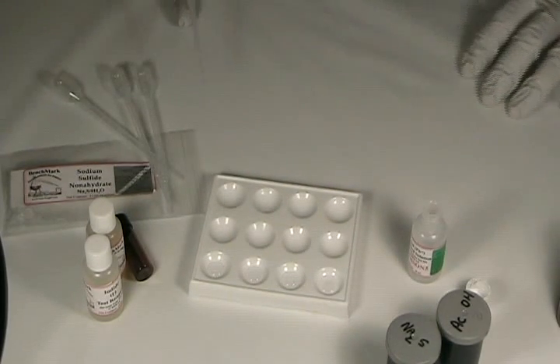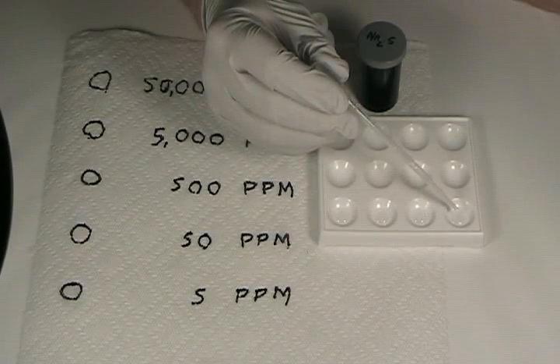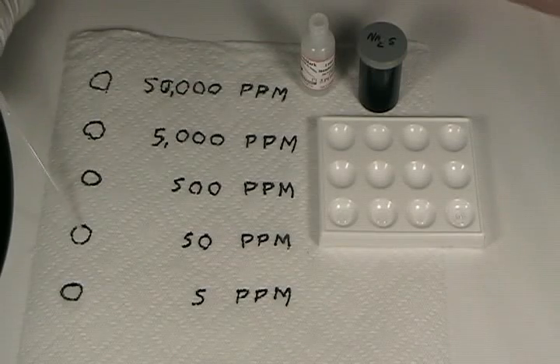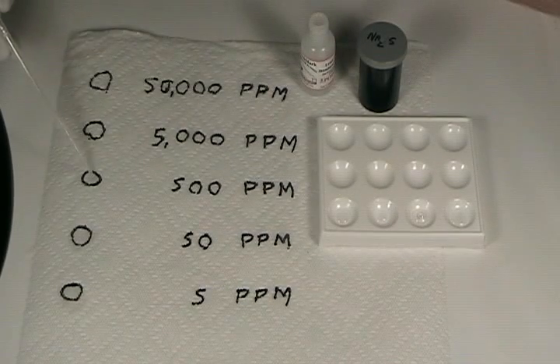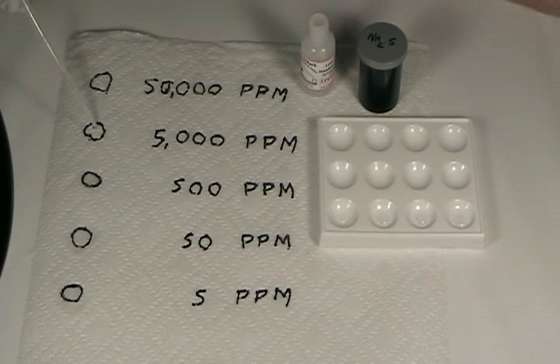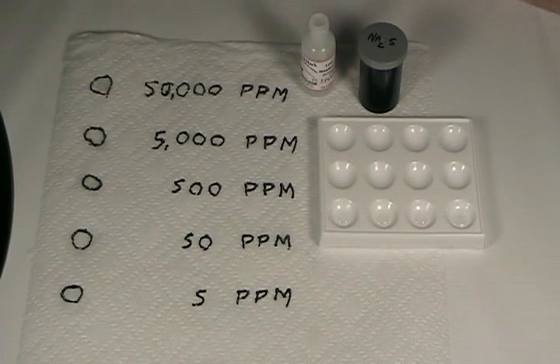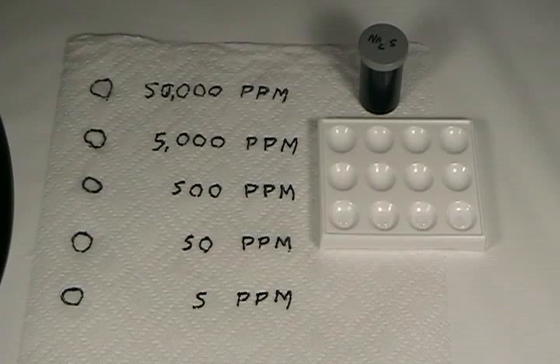We'll test these in a moment to see how they react with the sodium sulfide reagent. Before we start testing actual paint and household products, we want to see how the sodium sulfide reagent reacts with the different concentrations of lead. So I'm going to add one drop of the 5 parts per million solution, one drop of the 50 parts per million, one drop of the 500 parts per million, and one drop of the 5,000 parts per million solution. You can allow the spots to dry if you wish, or test them while wet — it doesn't affect the sensitivity of the reagent.